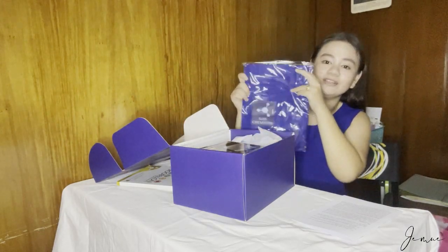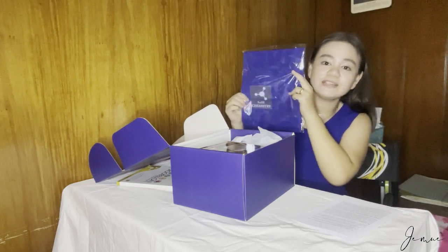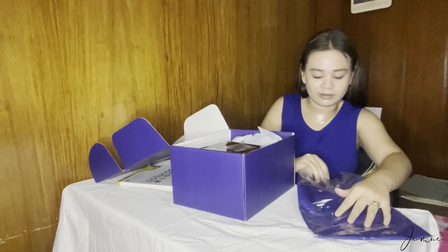First, we have an apron. May nakalagay din na logo ng SOSE Chemistry. SOSE pala is our college department — School of Science and Engineering. So yeah, we have an apron. Let's try to open it.